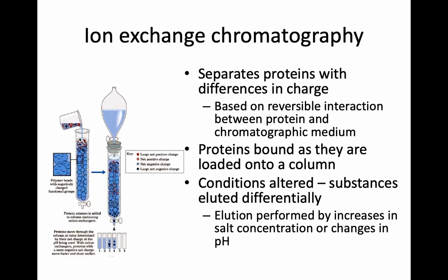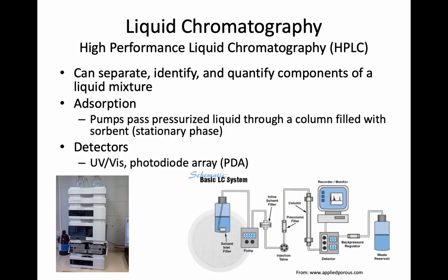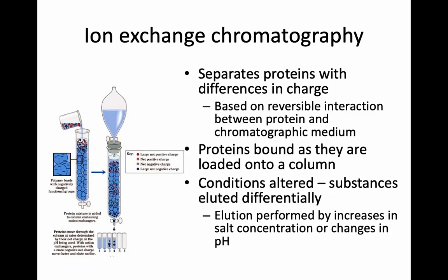This liquid chromatography and gas chromatography don't rely on chemical charge.